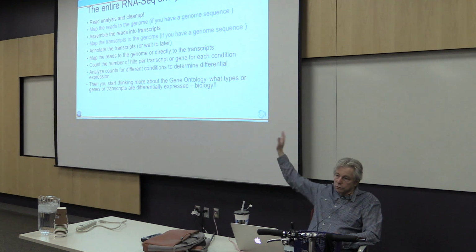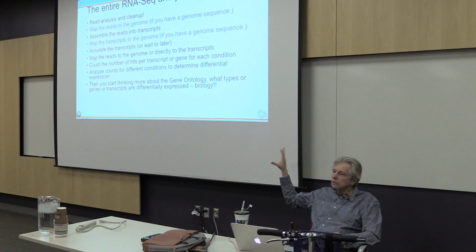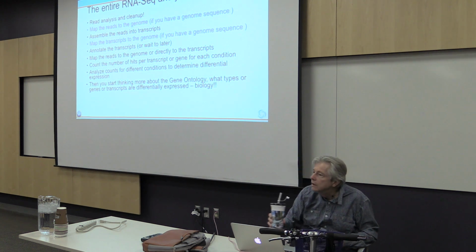But as far as your reference goes, most of the time you're going to be looking at the main genomic nuclear genes. That's what you're going to be mapping to, and so that's the only thing that you'll really see. Sometimes, though, you may include the mitochondrial and plastid for Arabidopsis, and that's often a good idea too, because sometimes those genes will look like some of your nuclear genes, and if you don't need to, you don't want to misidentify them.